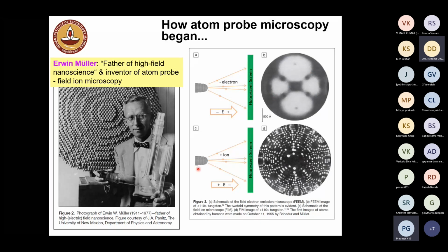That means on the same tungsten needle, he applied positive potential this time and the negative potential to the fluorescent screen. Now what you saw dramatically different was individual white spots on the fluorescence screen, which now represent individual atomic positions. That means he started evaporating atoms from the surface of this needle, and those atoms were impinging on a fluorescent screen, and all of these atoms now look like, as a result of the fluorescence, a white dot. Now, if you connect all of these dots, you see a kind of circular arrangement, and there are also crystallographic poles that are visible as smaller circles.